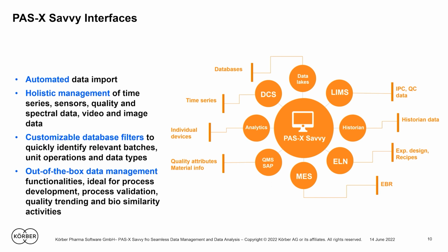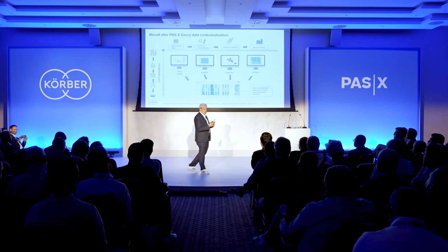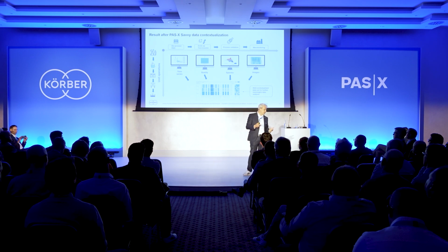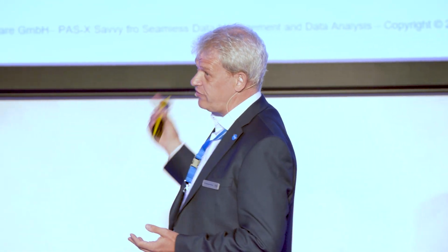And then you have, of course, lots of different runs in manufacturing, in development, and you have so many different data sources. You have time series, you have LIMS data, endpoint data, you have spectra for all your PAT systems, for example, chromatography systems. You may have pictures from your flow cytometer or even SDS pages here. And it's not about storing them, it's about linking them together.